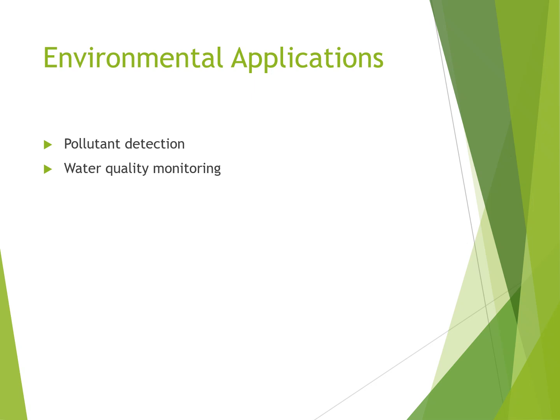Now we will discuss its application in the environment, in different environment related analysis, as it is very helpful in pollution detection. It also has wide application in pharmaceuticals, as in drug analysis, as already discussed. In the environment there is water quality monitoring, as toxic substances and pollutants, even if a minute or low concentration is present, can be detected by fluorescence spectroscopy.